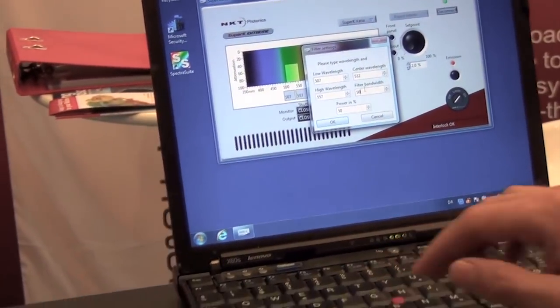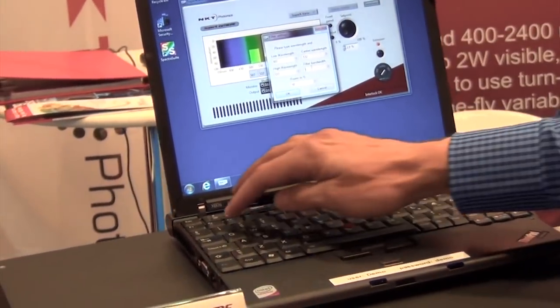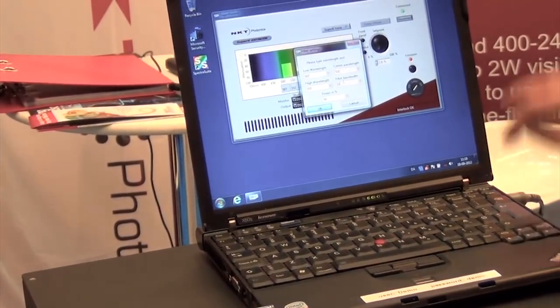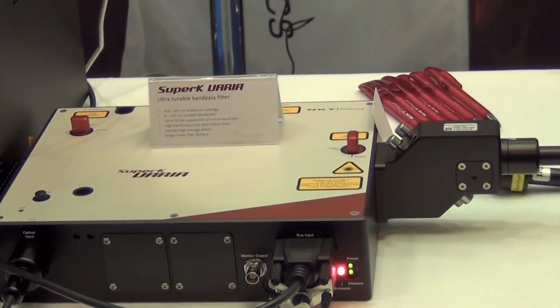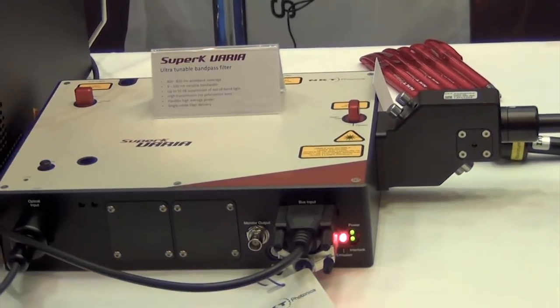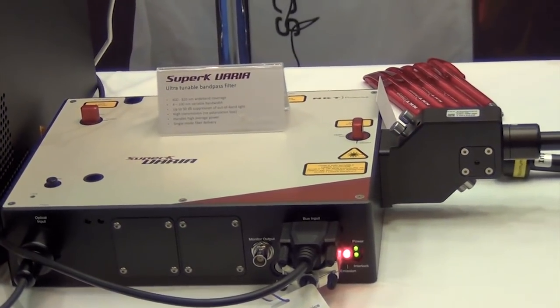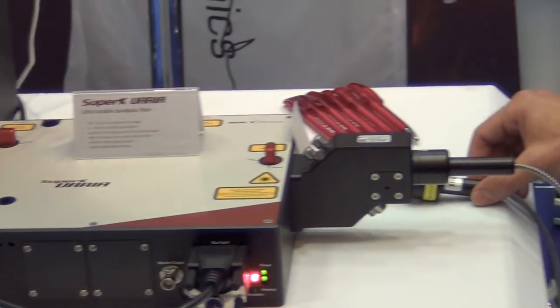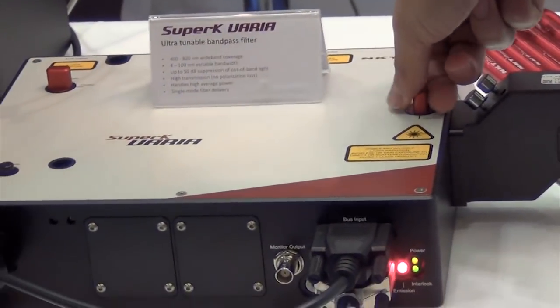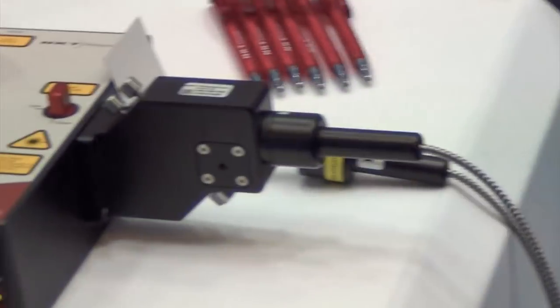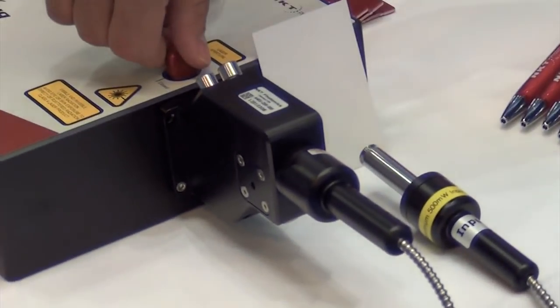In this case we will change the bandwidth to about 10 nanometers. The Super-K continuum is going through the filter and we get the green light out of this filter device. It can either be provided as a collimated output or a fiber connectorized output like an FC-APC connector or FC-PC connector. And here we have the output.